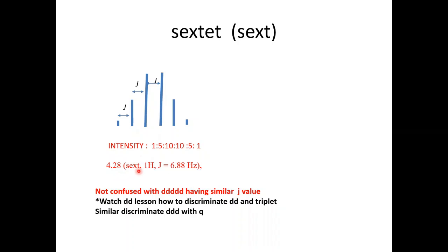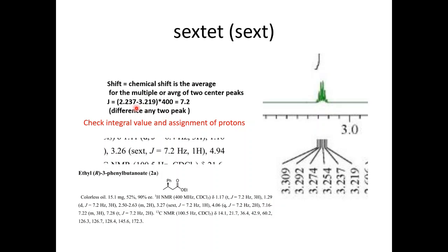So the short form of sextet is SEXT when hydrogen J telecolyze. And now how you report the chemical shift, just like this. So this is a real example. I took a spectra from a journal supplementary information. So the chemical shift is the average of the multiplet. You can click on this one, click on this one, take the value and average it, or you can take the average of two center peaks.